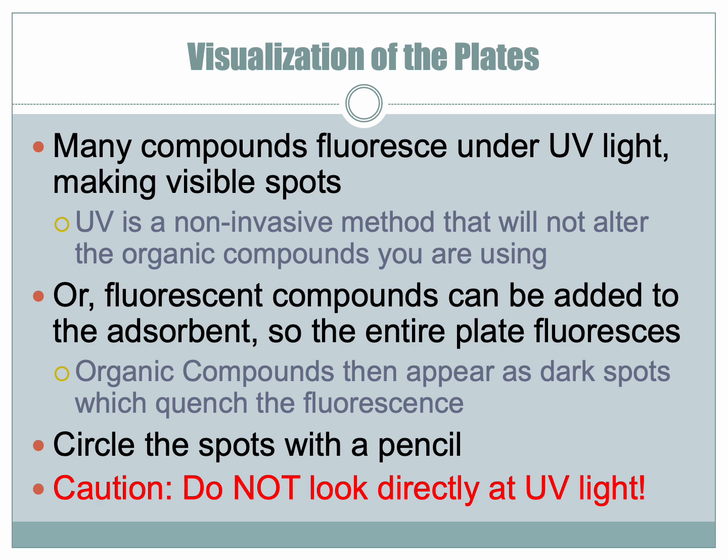So most of the compounds that we're going to be looking at absorb ultraviolet light. And so the plate is totally green except for where the organic compound is, because the organic compound is going to absorb the ultraviolet light. So you'll see a black spot where you put your compound.